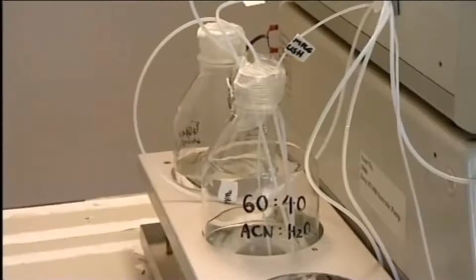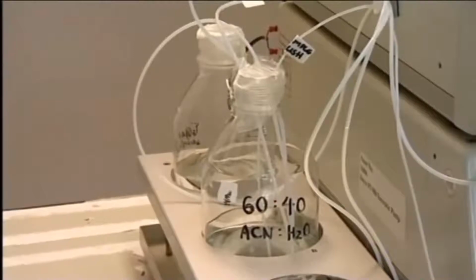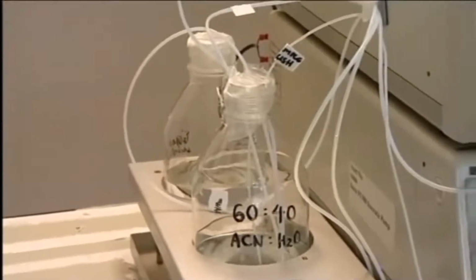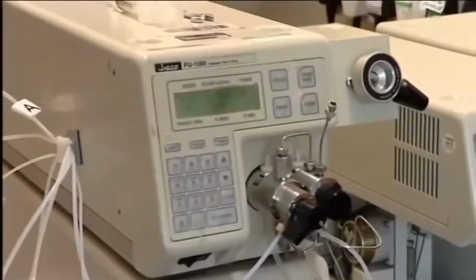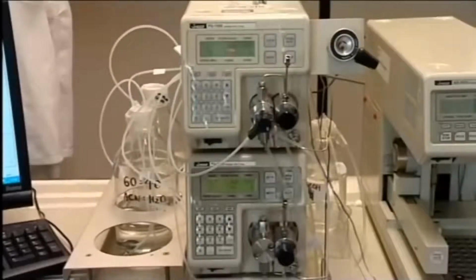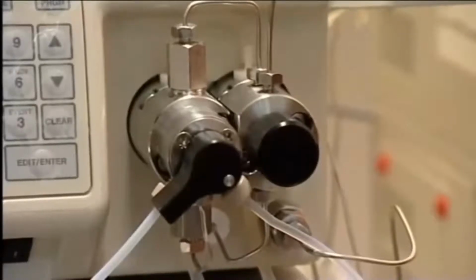In this case, one solvent is water, very polar, and the other ethanenitrile, less polar. The operator can decide on a mixture with the correct polarity for the separation she is doing. These are the pumps. They produce a pressure of 15,000 kilopascals, 150 times that of the atmosphere, hence the name high-pressure liquid chromatography.